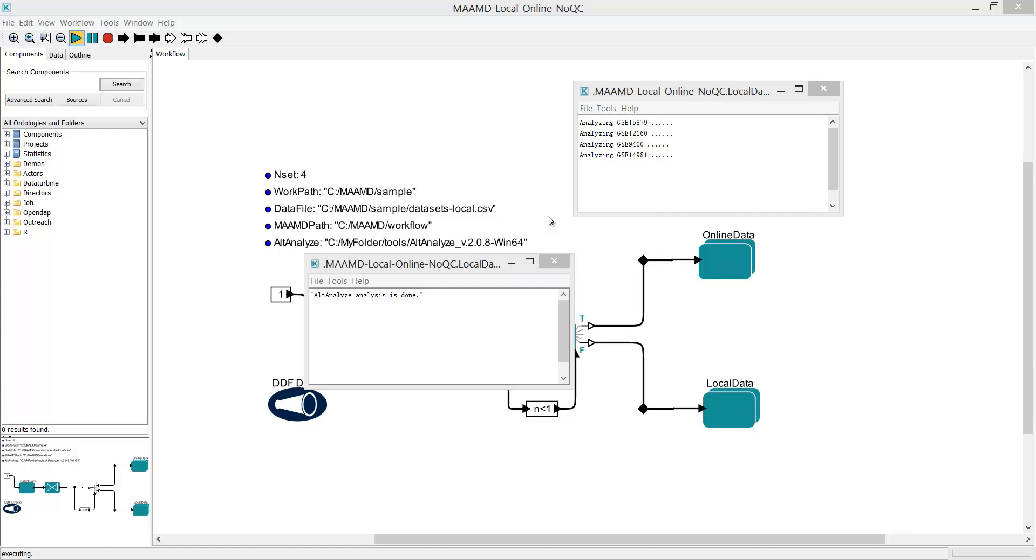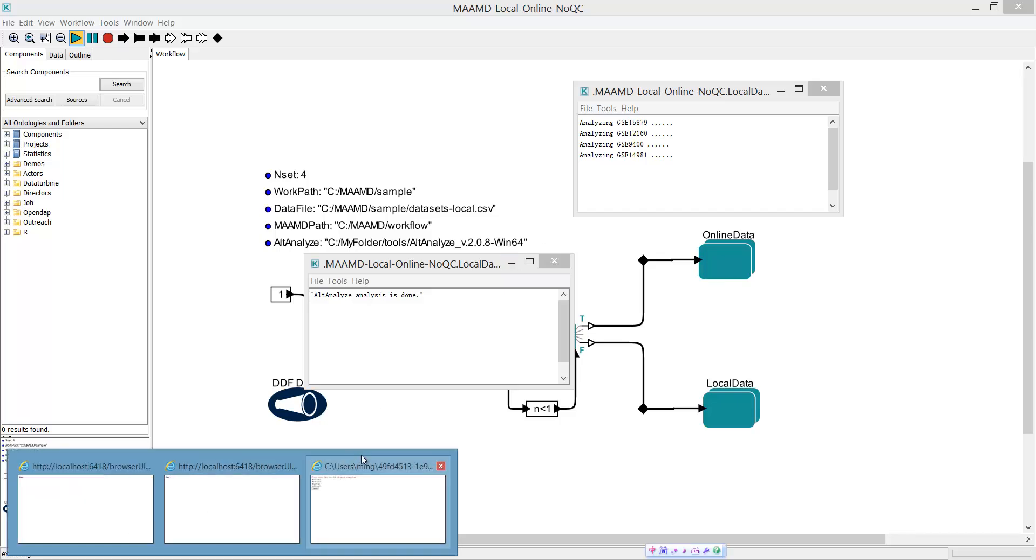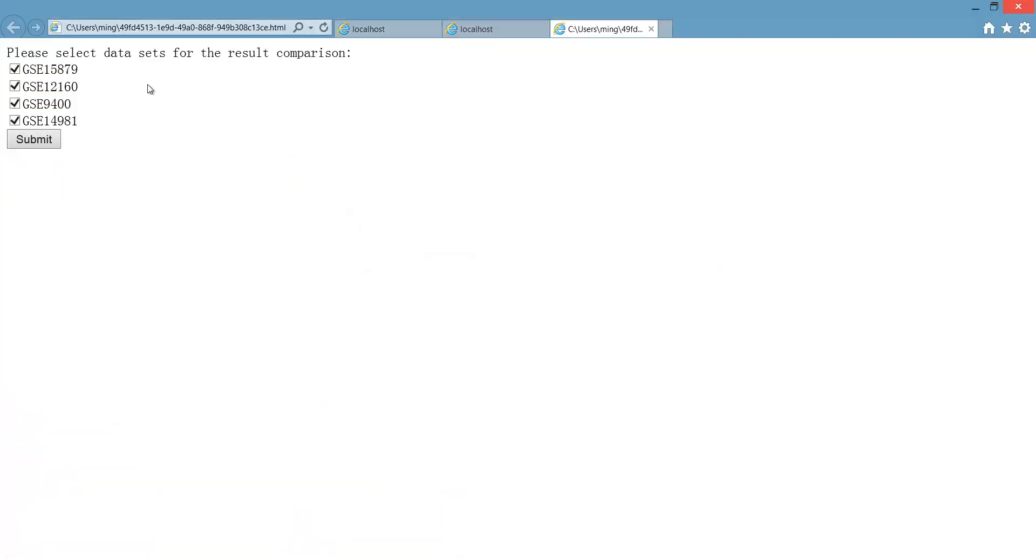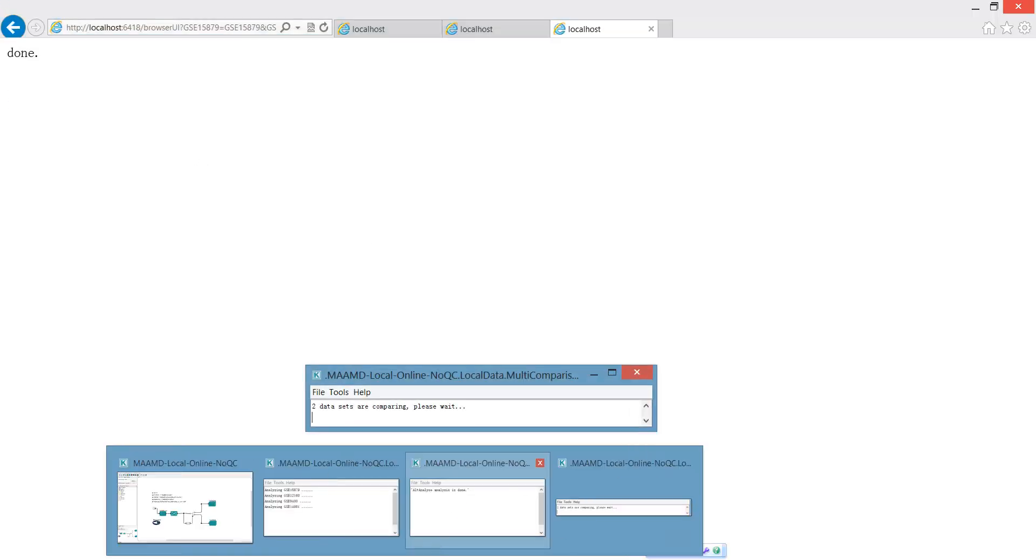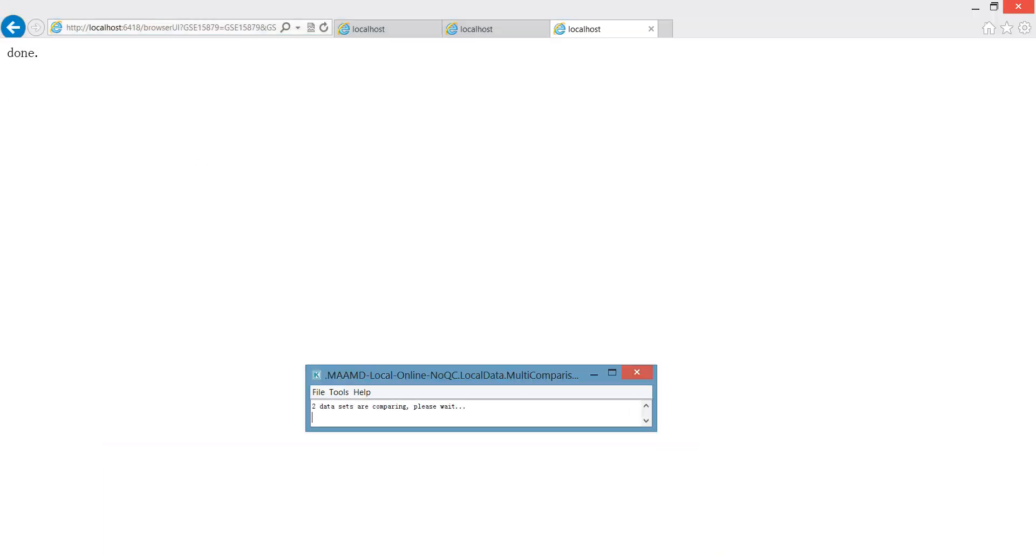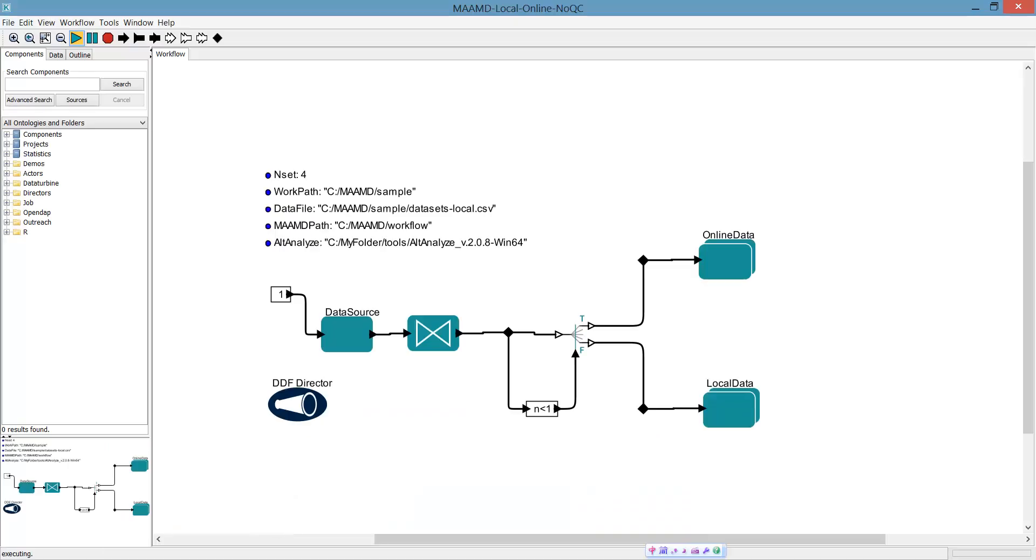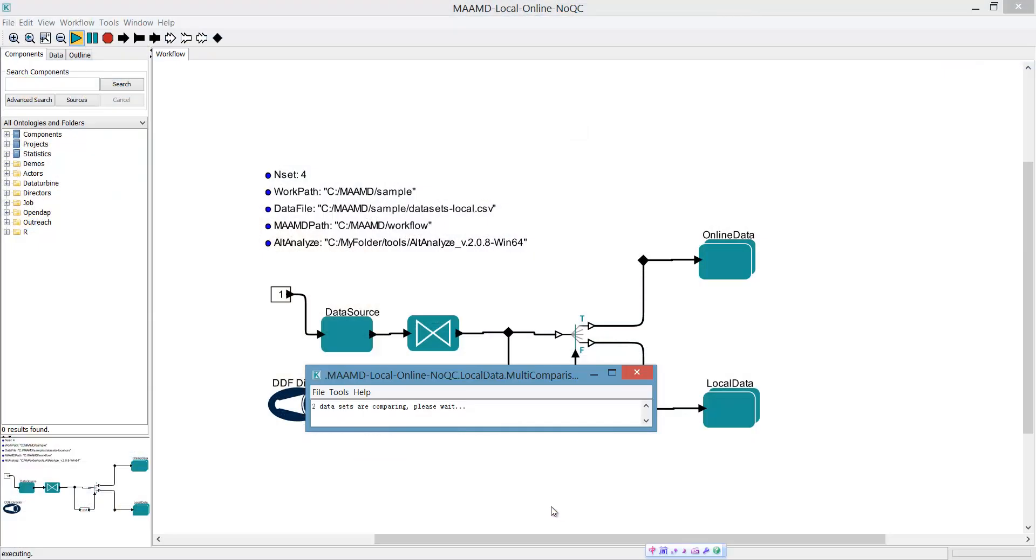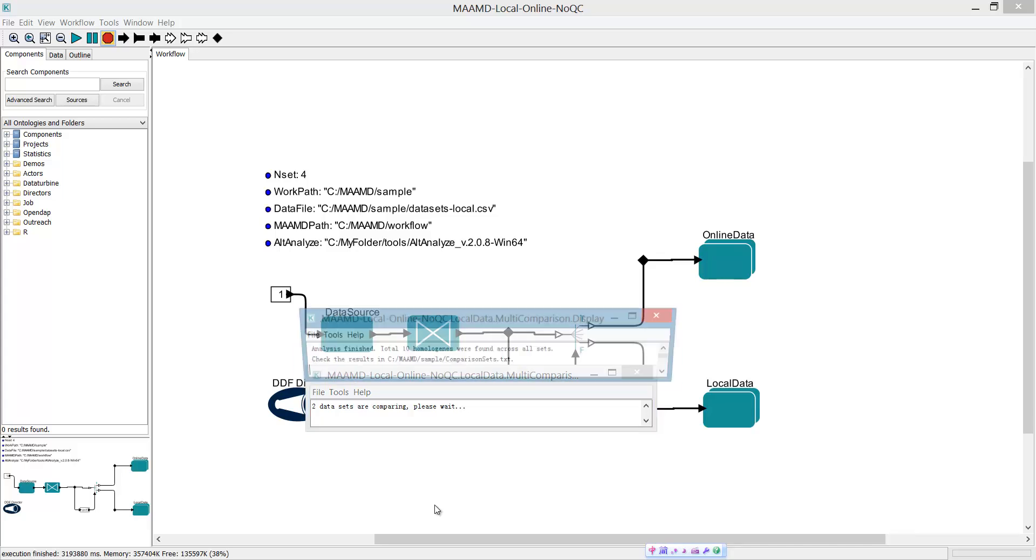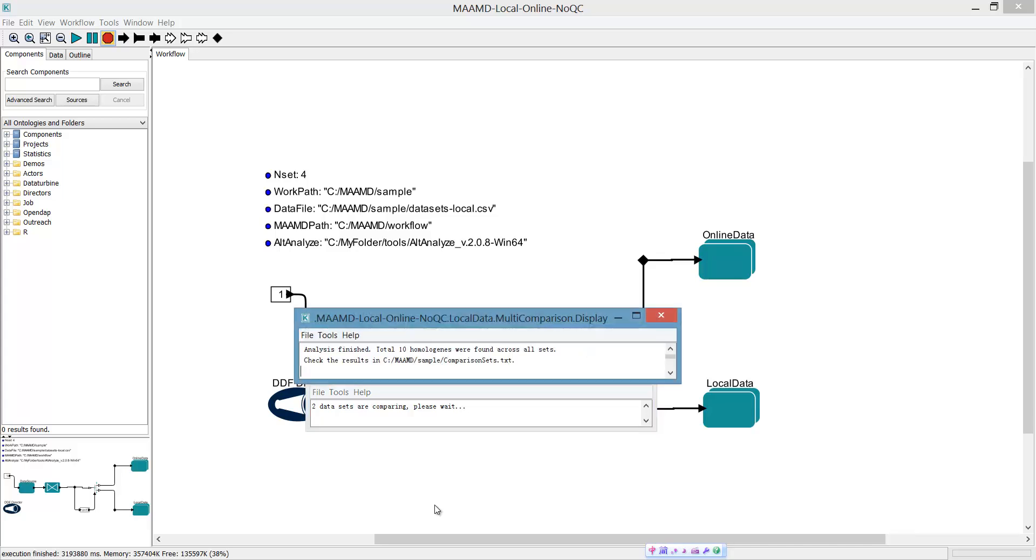Now you can switch to inter-dataset analysis to identify the conserved genes between datasets. Once you finish the inter-dataset analysis, a dialog will show how many genes you have found between the datasets and where the results are stored.